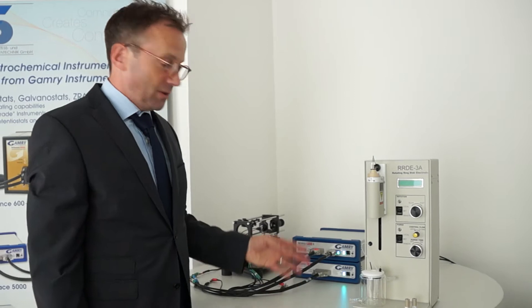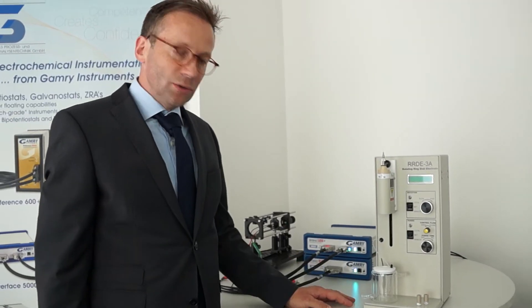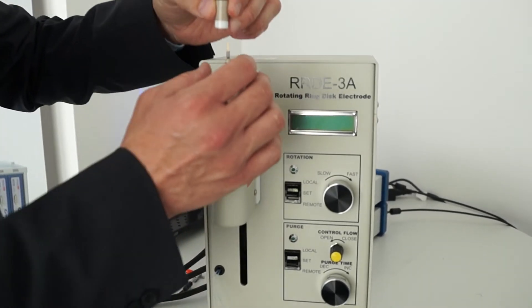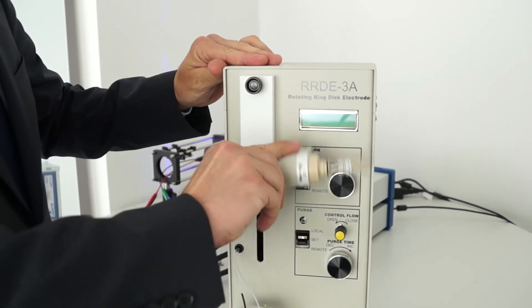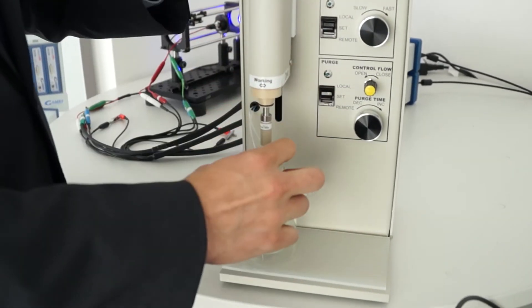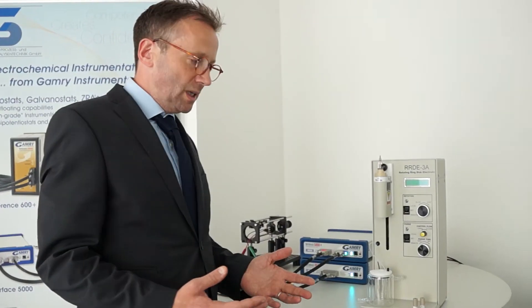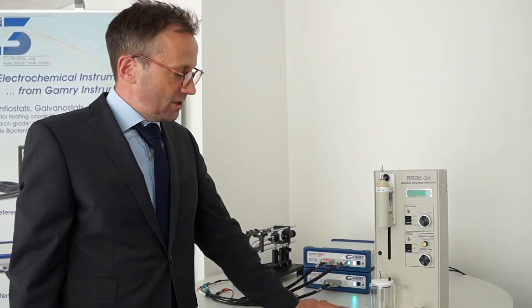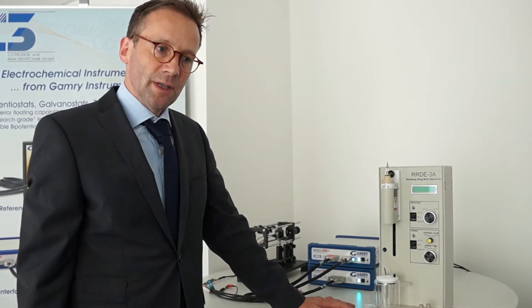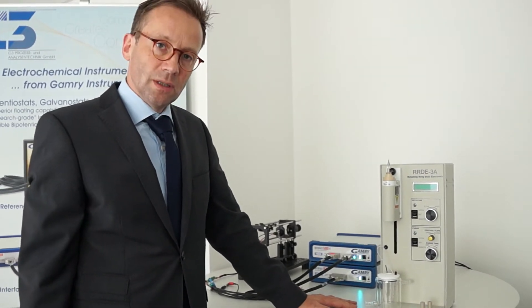Another way to make sense of this bipotentiostat setup is, for example, to combine it with a rotating ring disc electrode device, which is usable in two different fashions. The first one is the RDE working fashion, where you combine only one potentiostat with this instrument to make your setup run with a rotating electrode. This creates hydrodynamically controlled situations, which are necessary to turn off mass transport limitation, and is useful for finding out the saturation current of your catalyst without mass transport limitation.